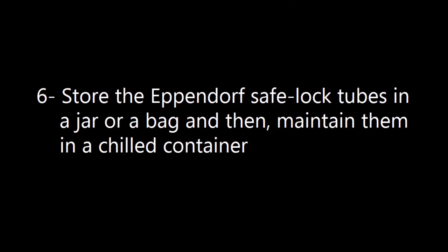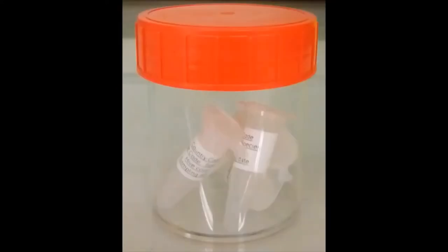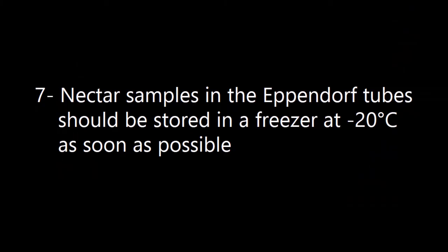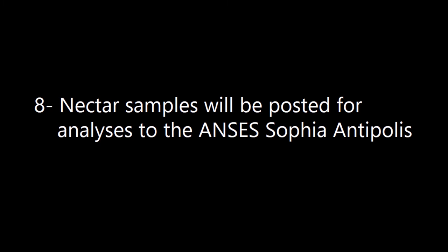The Eppendorf SafeLock tubes were stored in a jar or in a bag, and they were then kept in a chilled container. Eppendorf tubes of nectar samples were stored at minus 20 degrees as soon as possible. Nectar samples were posted to the ANSES Sophia Antipolis lab for analysis.